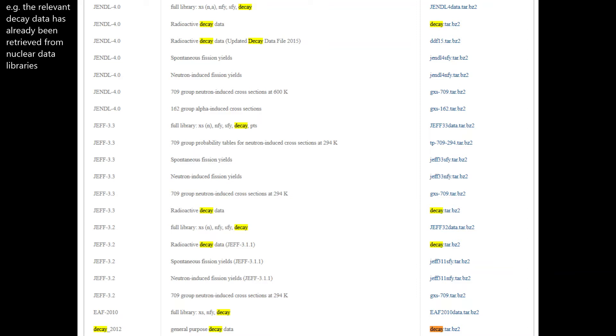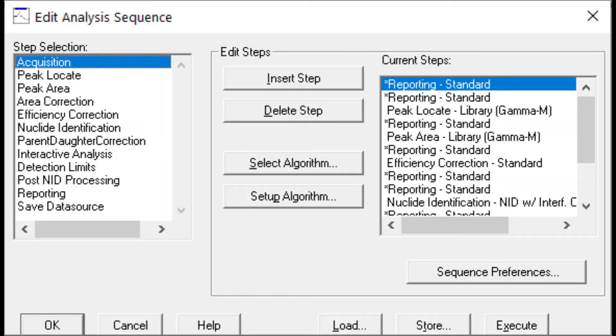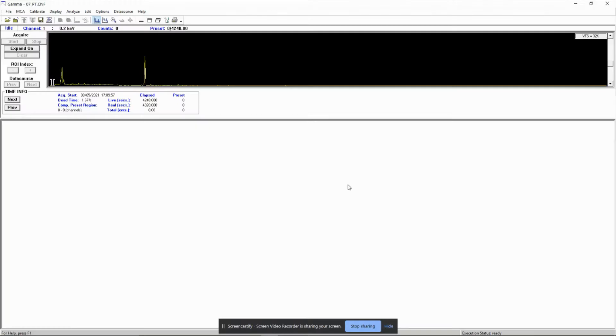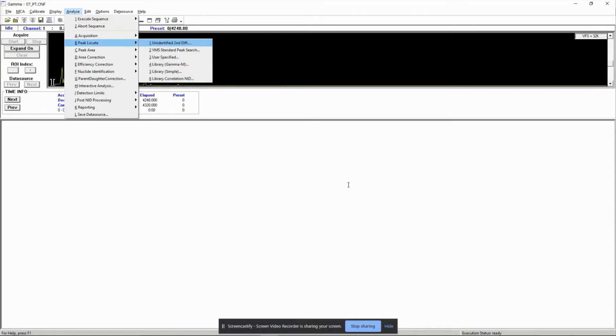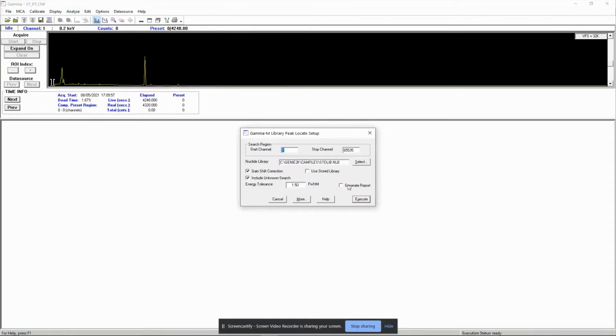So you want to use Genie to analyze the peak areas from each gamma line and therefore how many nuclide decays the gamma detector picked up. This is the analysis sequence I've chosen to do so. You may wish to change any step, but the general idea and error messages remain the same.